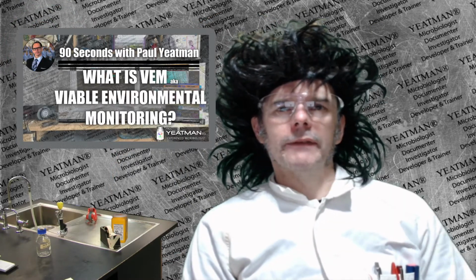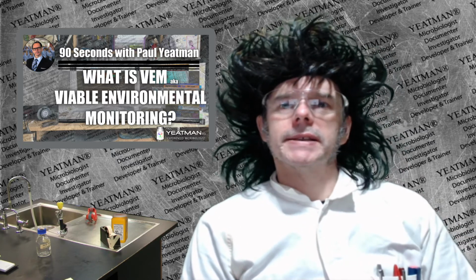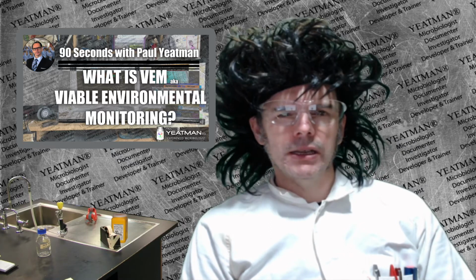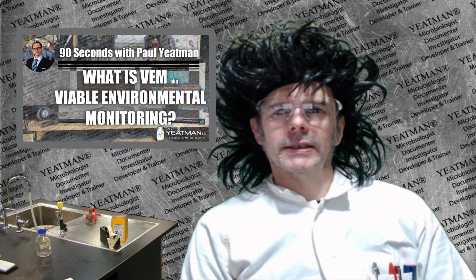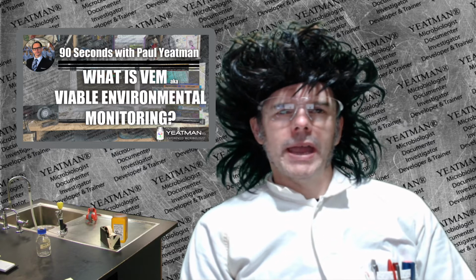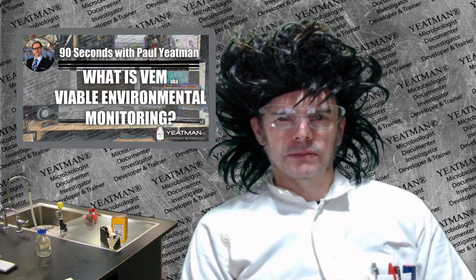What is viable environmental monitoring? Viable environmental monitoring is a sampling of surfaces, air and liquids related directly and indirectly to the manufacturing of sterile and non-sterile products. Both these types of manufacturing are conducted aseptically to reduce the chance of contamination, so knowing how much, if any, contamination is present is what VEM tells you.